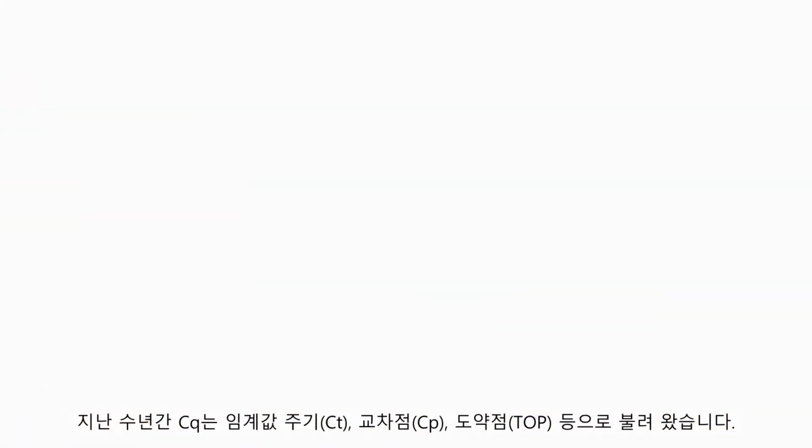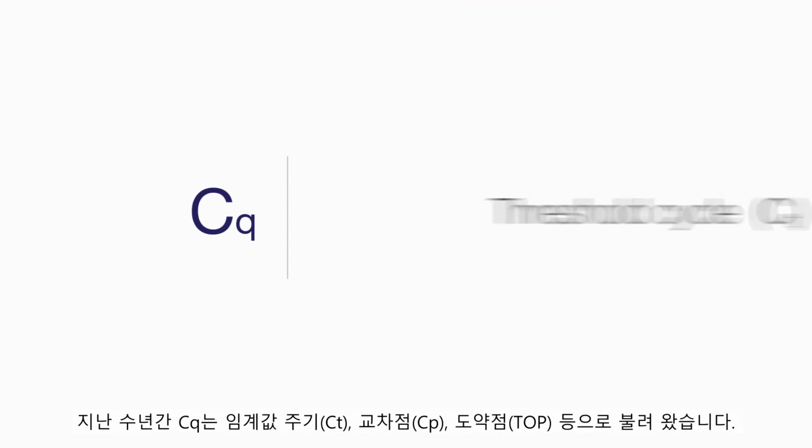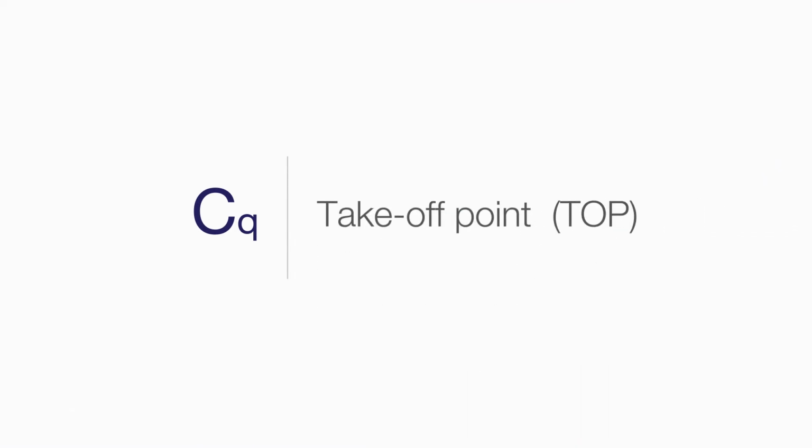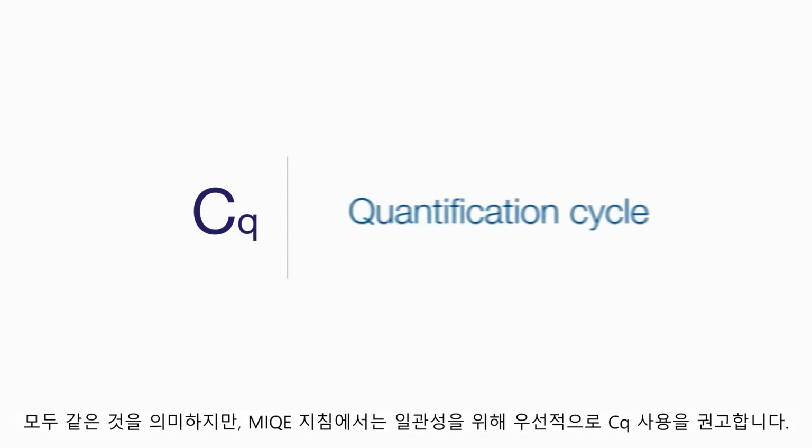Over the years, CQ has also been referred to as a threshold cycle, or CT, crossing point, or CP, and takeoff point, or TOP. They all mean the same thing, but quantification cycle is preferred according to MIQE guidelines to ensure consistency.